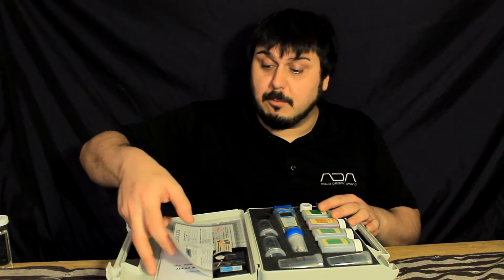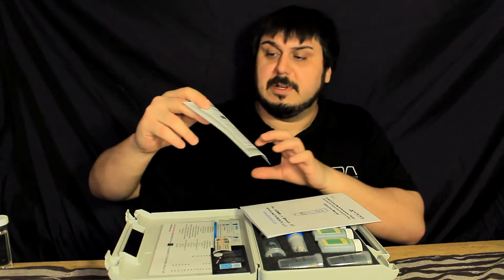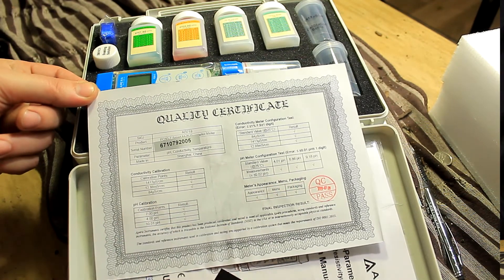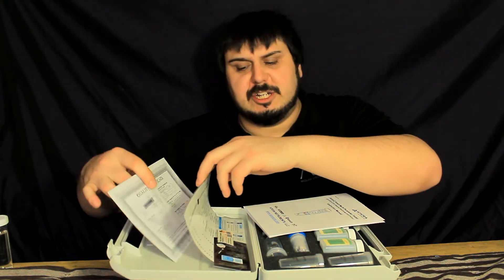Alright, here we have everything that's in the box. Let's pull out all the paperwork and see what we've got. To start with, there is a quality certificate that shows everything that has been tested before it went out the door, which is really cool. You can see that everything passed and the unit was ready to ship.